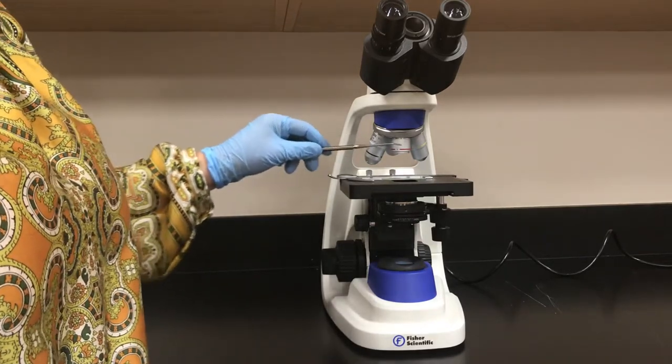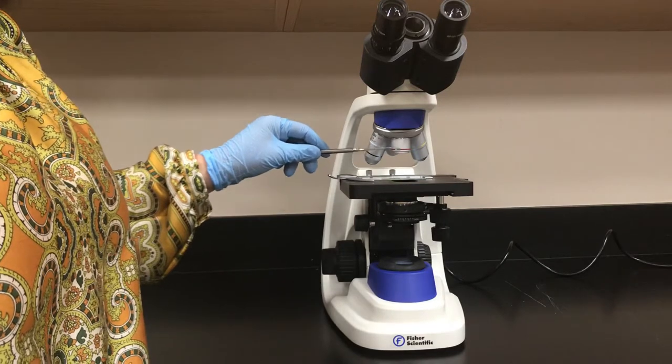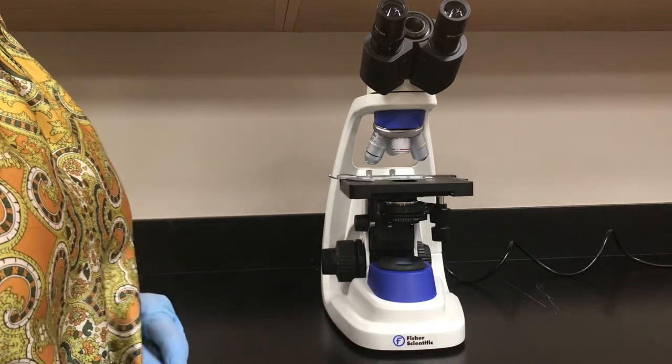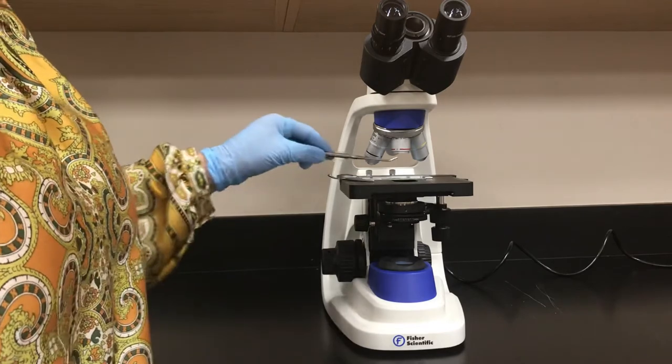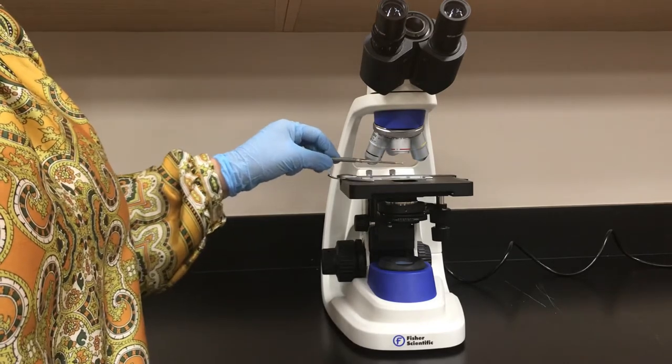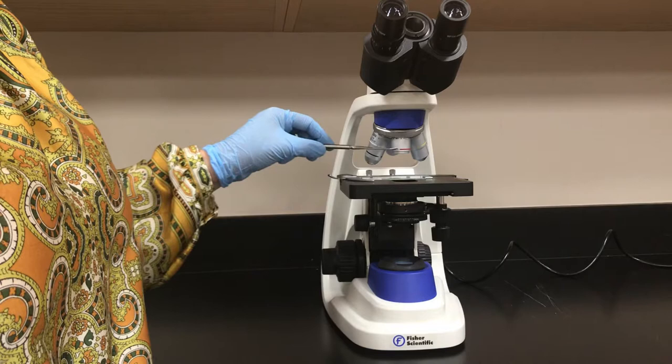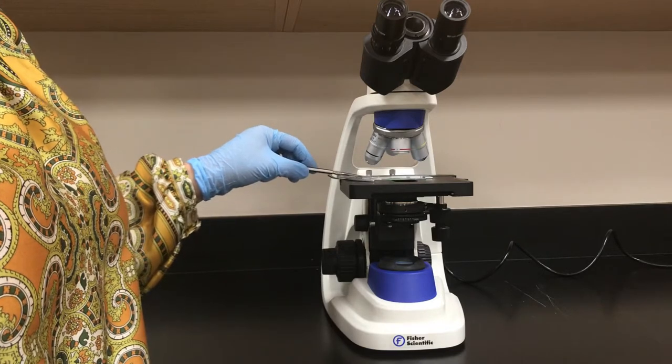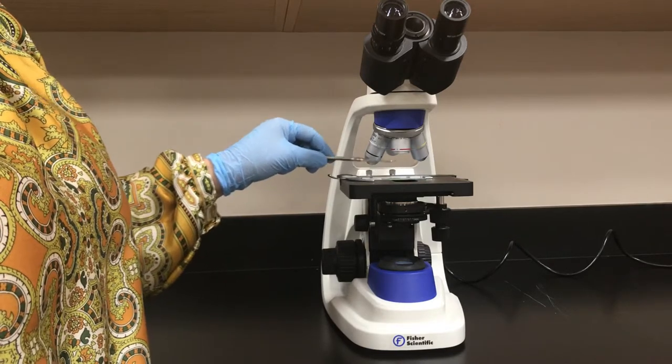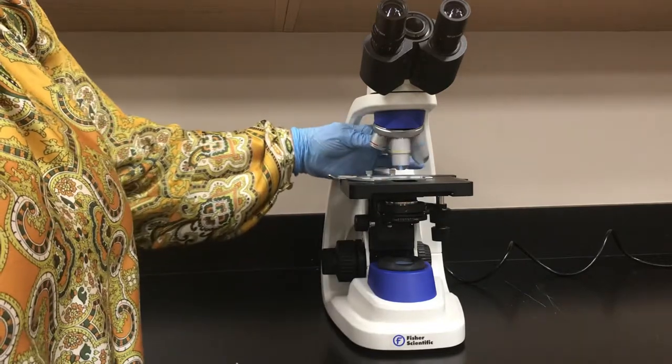This is the shortest one, red color coded. We call it the scanning objective. The working distance, as you see, between the objective lens and the microscope slide is quite larger compared to the other ones.